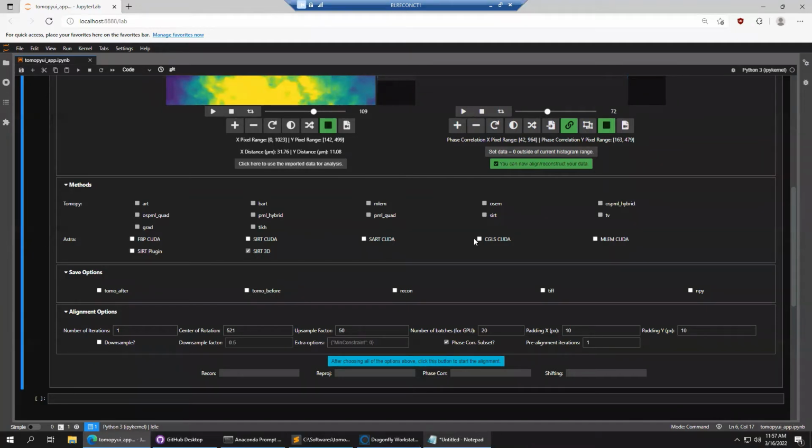There are publications on every single one of these algorithms, and a lot of them compare and contrast each other as well, sometimes with real data, oftentimes with fake data. But they will tell you, this one's really good for heavy metal artifacts or things like that. But there's an infinite number of them. Yeah, there's just so many.